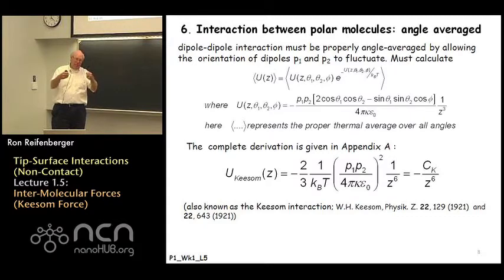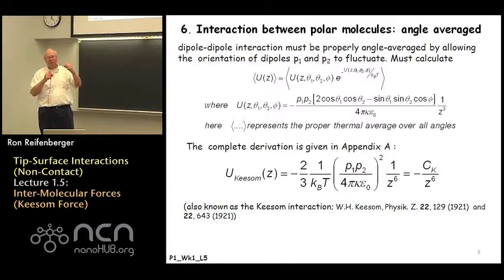So the interaction potential energy now is going to depend on the 6th power of the separation between these two permanent dipole moments. So if you've been following along the lectures, what we're showing is that every time you make the situation a little bit more complicated, you go from point ions interacting, which is a 1 over Z. You start to put ion dipole moments in and allow them to interact.